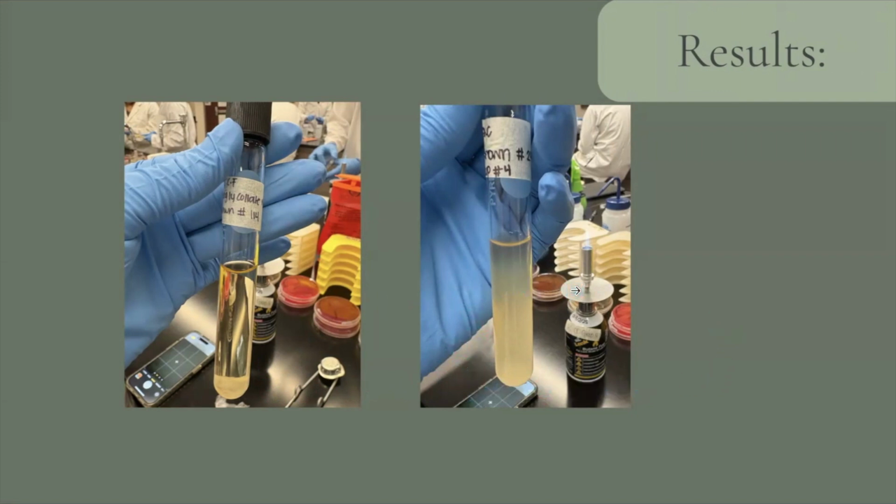For our motilities, we did not get pictures of them, but these were the ones that we poked straight through. Some of them had dispersed and basically ate up the agar around it. And one or two did not.